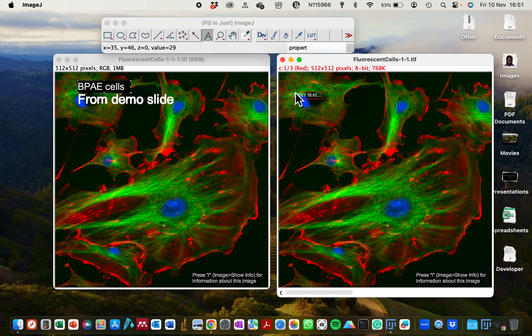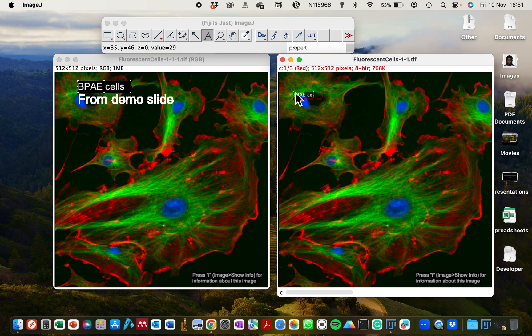And then you can type or annotate the image. So this particular image we are going to give it its name and annotate it with the type of cell that it is: BPAE cells from demo slide.